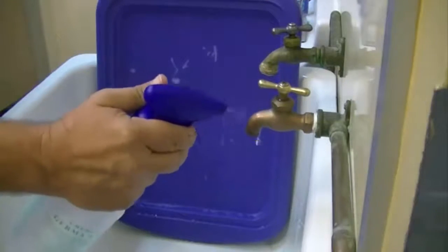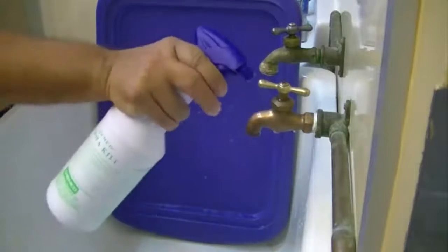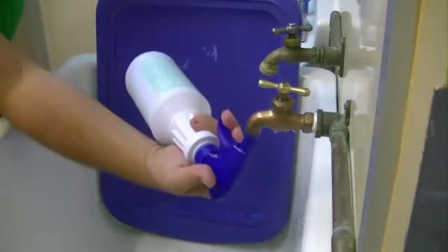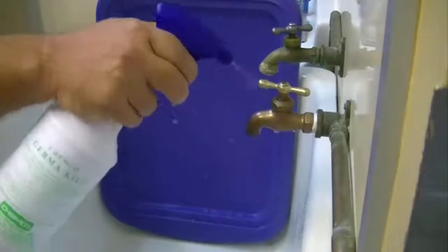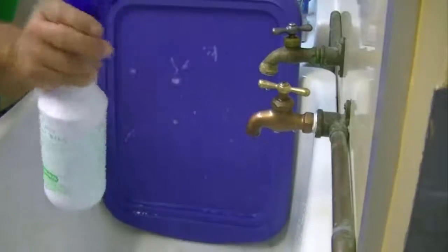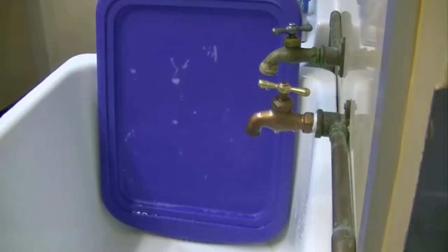If using the bleach spray method, squirt a mist of bleach water all around the outside of the tap and, again, inside the tap opening too. Be careful to avoid bleaching your clothing. Although both methods are shown here for the sake of demonstration, only one of these methods for disinfecting the tap is needed to ensure a safe sample.